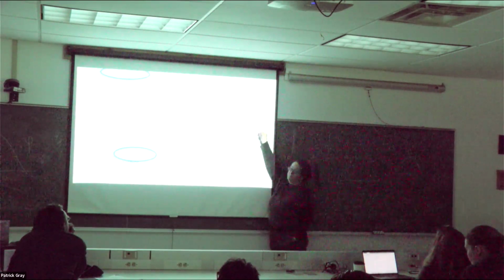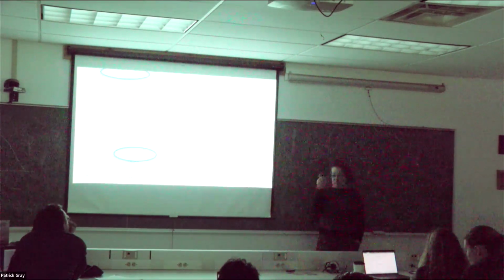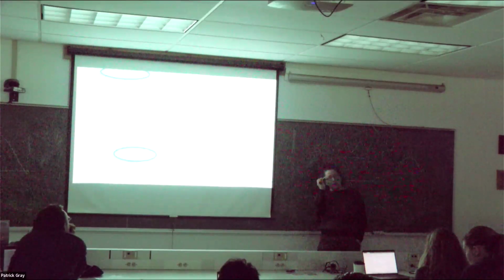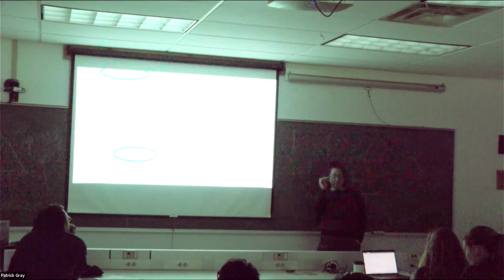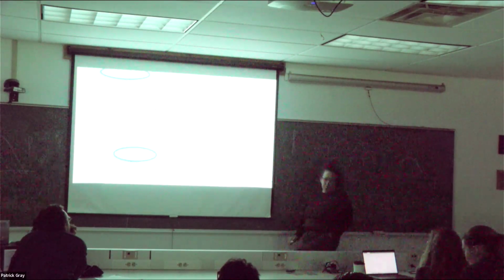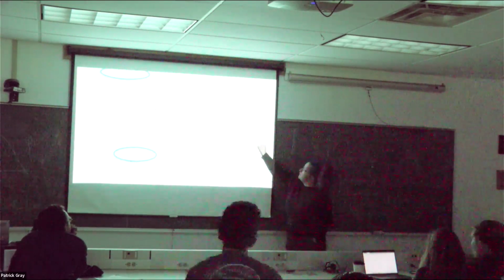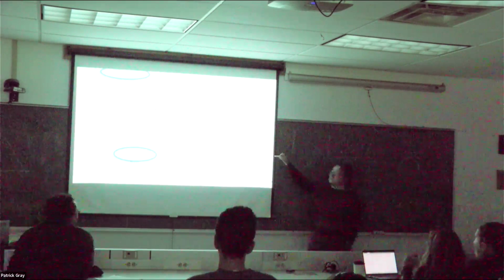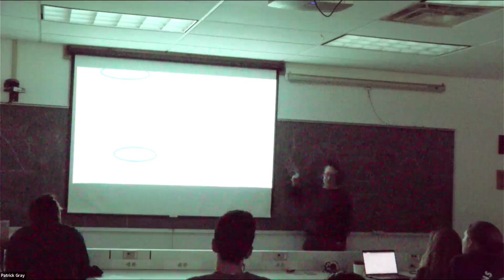And what we're going to do is measure the fluorescence in our solution of chlorophyll in acetone. Then I'm going to remember, oh, Ivona said that if I drop some acid, I'm going to kick out that magnesium, okay? So I'm going to drop some acid in that solution. At that point, all chlorophyll is going to start kicking out the magnesium. So everything that is in there, if I measure it, is not going to be chlorophyll. Is everybody following? Okay, so I'm doing the second measurement. All my fluorescence is now associated with pheophytin or pheo things.